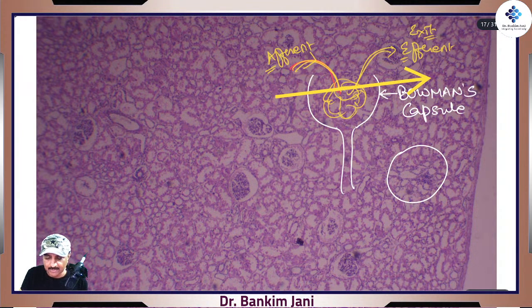This boundary is our Bowman's capsule. Inside, all those tufts of capillaries will be like this. This will be the transverse section. That's what you are watching here.